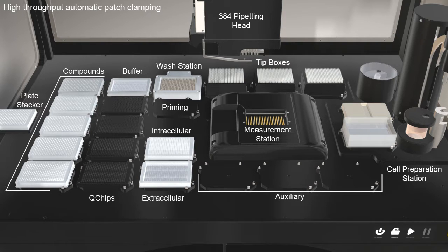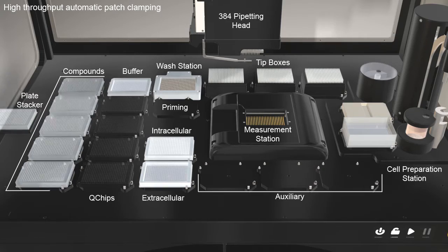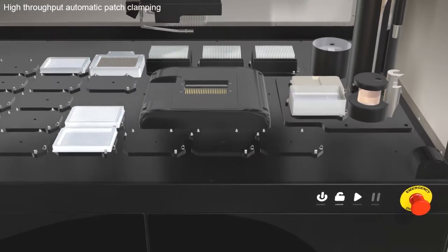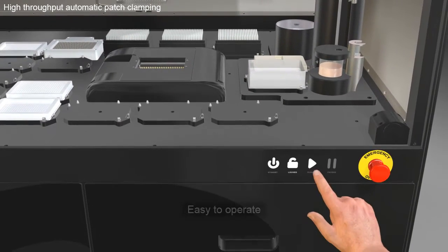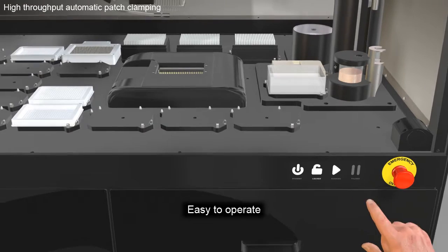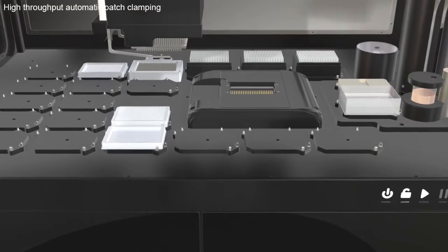Cube comes as standalone or as integrated into existing robotic line. A simple click on the Start button initiates the experiments.